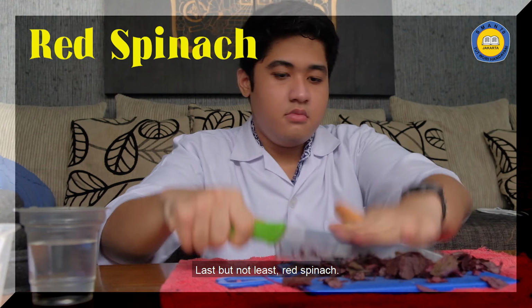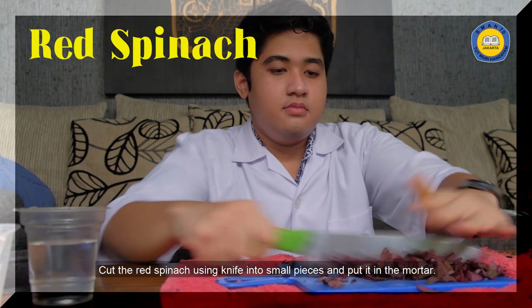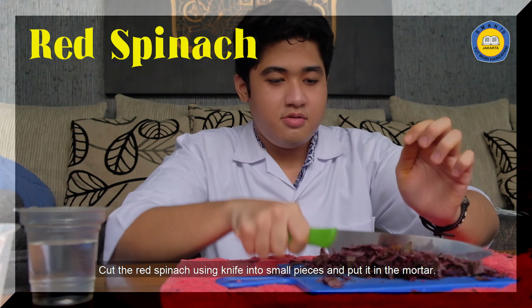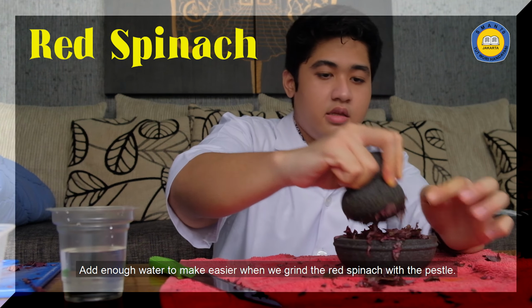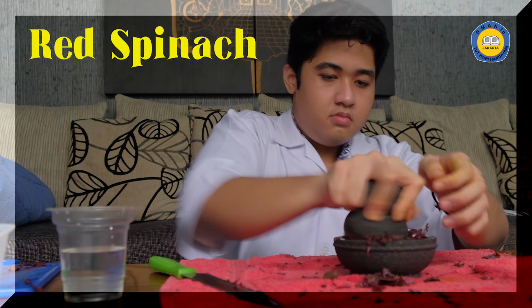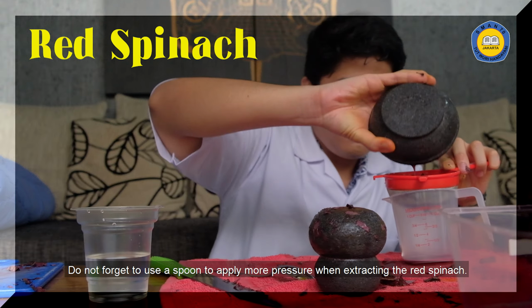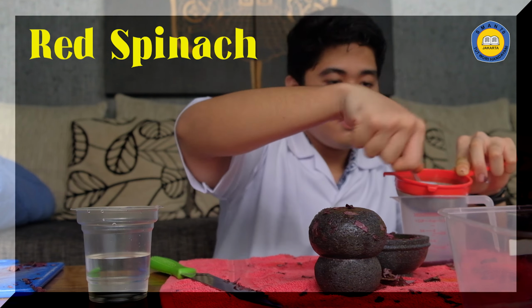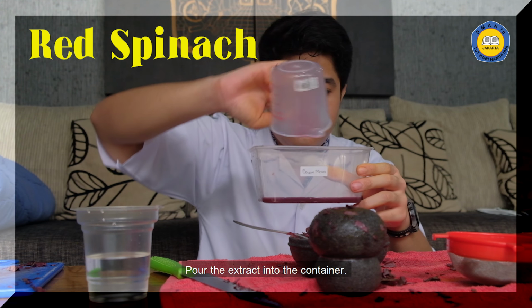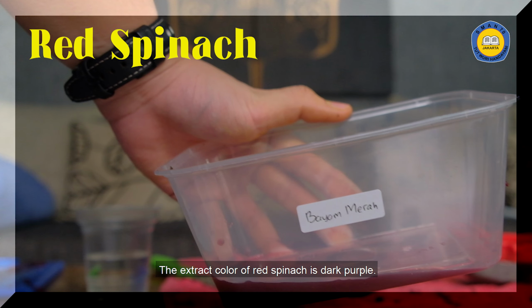Last but not least, red spinach. Cut the red spinach using a knife into small pieces and put it in the mortar. Add enough water to make it easier when we grind the red spinach with the pestle. Filter the extract of the ground red spinach. Do not forget to use a spoon to apply more pressure when extracting the red spinach. Pour the extract into the container. The color of the red spinach extract is dark purple.